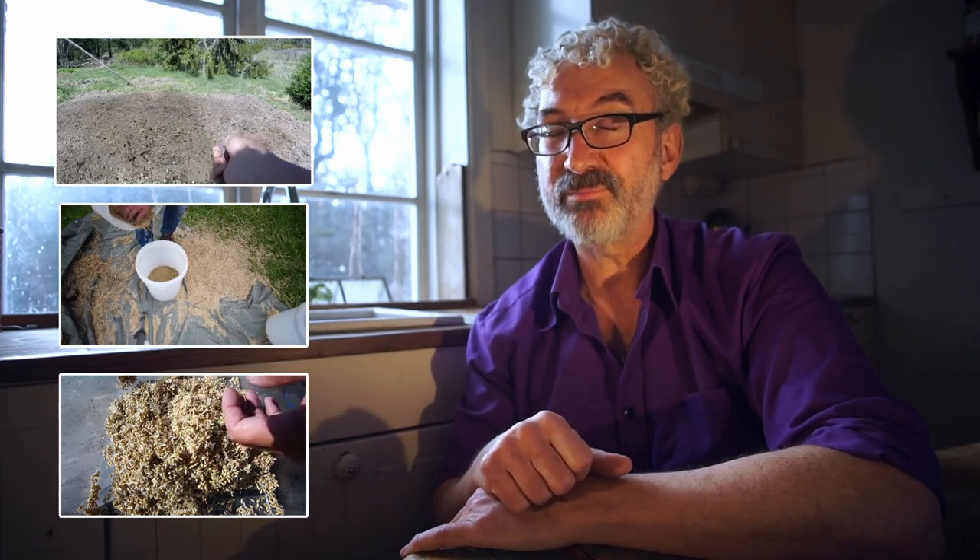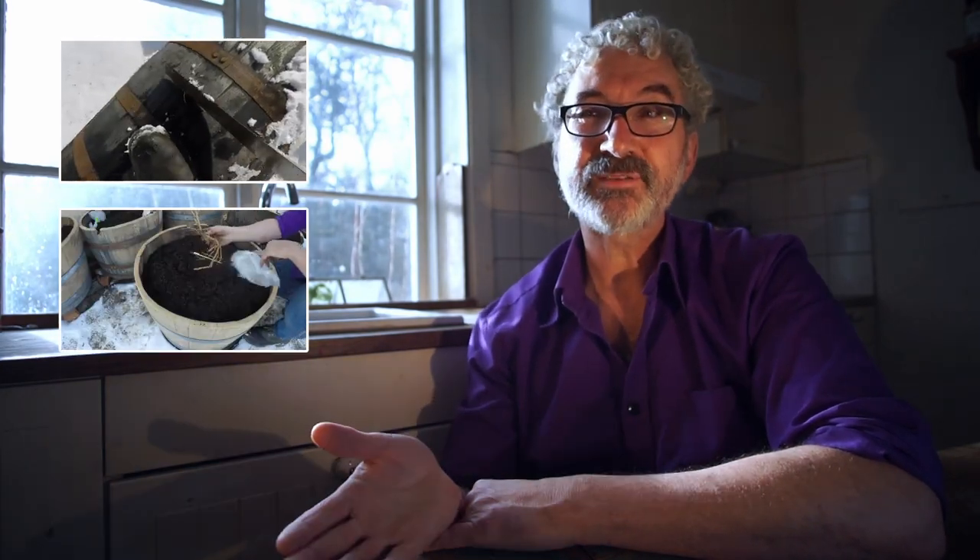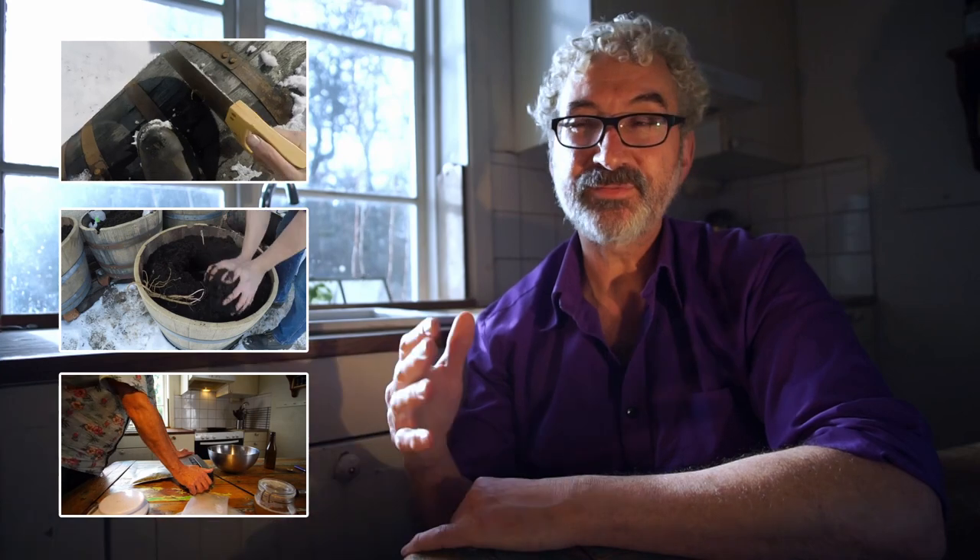Step number two: I made some planters, planted my hops, harvested them, dried them, and vacuum sealed them. Then step number three was collecting some material outside in the hope of capturing some wild yeast and bacteria to ferment my beer with.